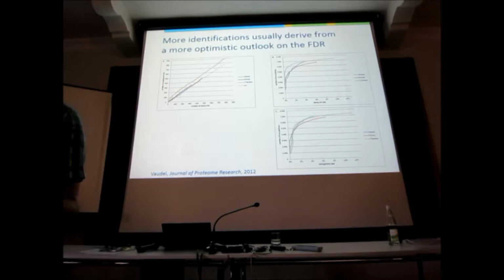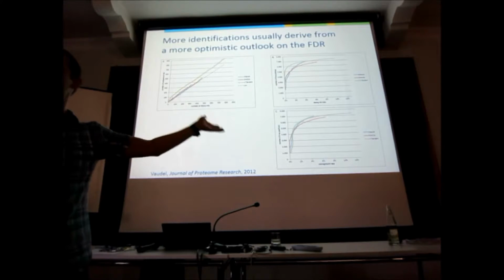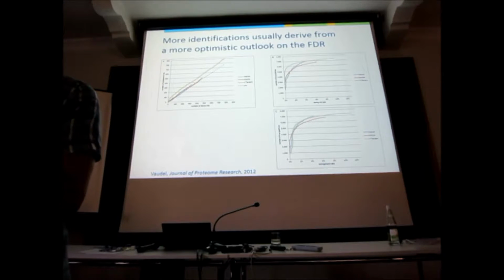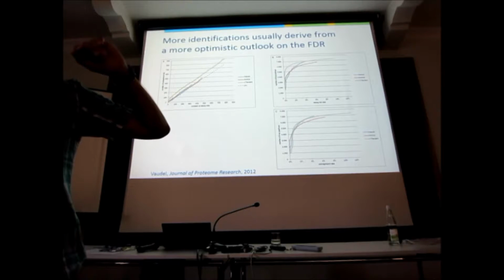So the algorithm that gives you the biggest return is somehow exploiting something about the decoys that fails if you give it a real biological sample as an entrapment. And so we have a way now to calculate whether FDRs that are estimated make sense. It's not a perfect way, but we can already show that Tandem has an issue here. Okay?